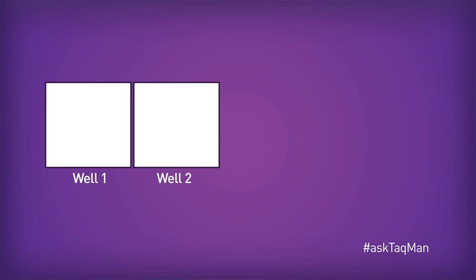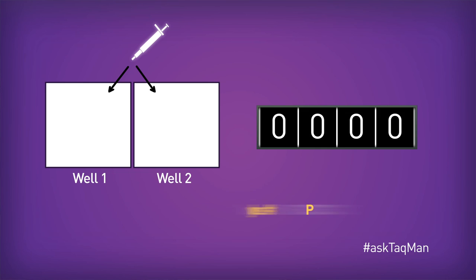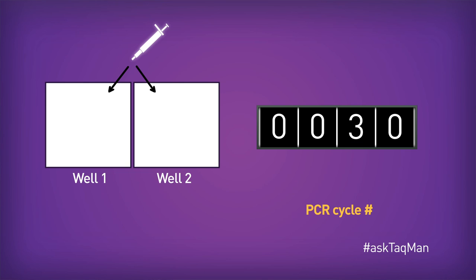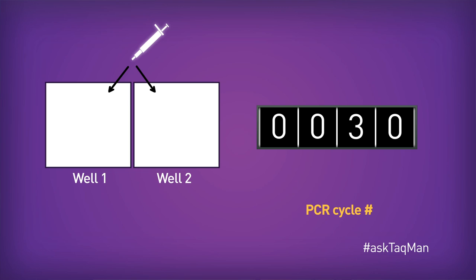Say that we're looking at two specific wells on my reaction plate. I pipette exactly the same amount of the same sample into each, and then amplify in real-time. A short time later, we reach cycle 30. As at every cycle, the instrument will take a reading of my reporter dye. I expect those two readings to be identical, since I started with the same reaction components. Unfortunately, they're not, due to a system inconsistency between these two wells.